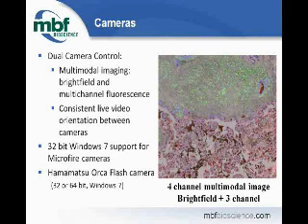One of which is the new Hamamatsu Orca Flash. That's a monochrome camera that works in 32 or 64-bit Windows 7 operation. And I've used this before also with Epitome imaging as I'm testing out the hardware and software. And it works great. And so this is just one of many options that can be integrated into your system.